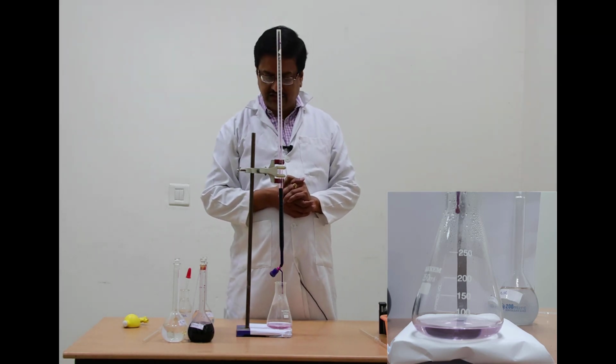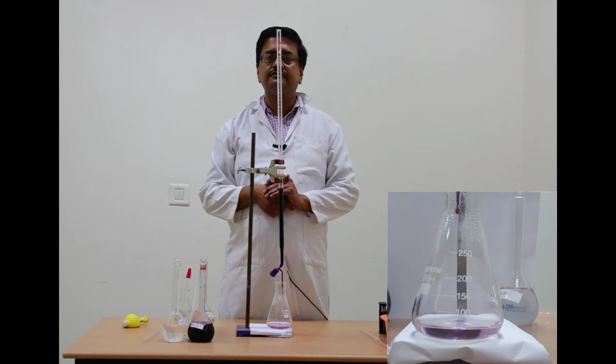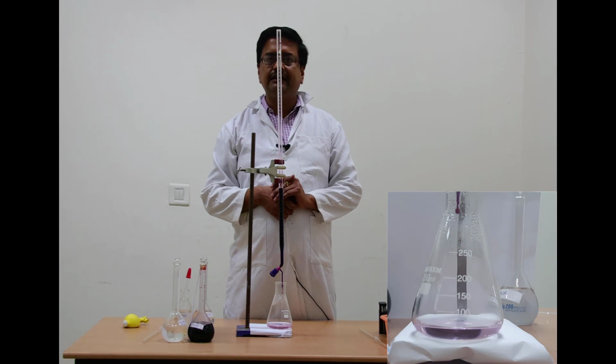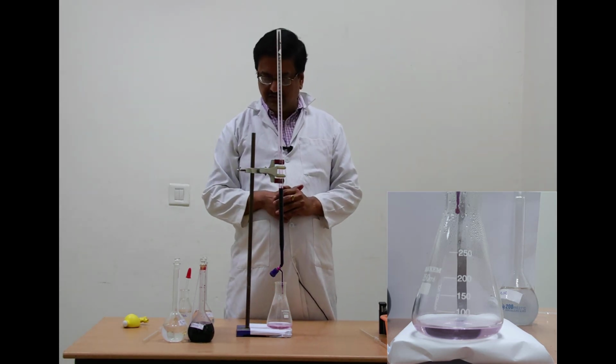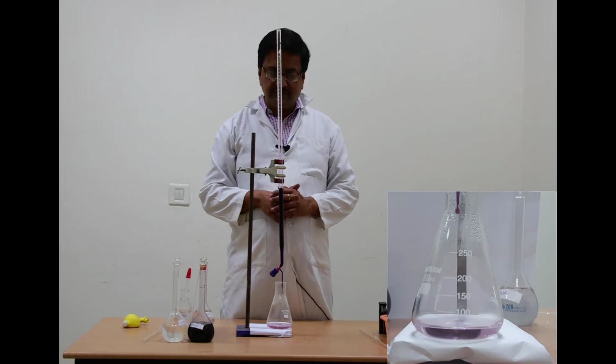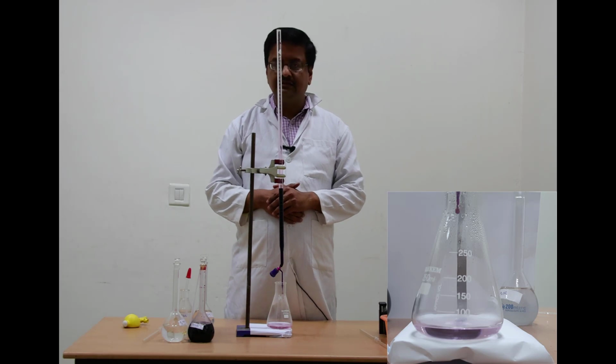So you have one reading as 12, the other one is 12.1, and the third reading is 12.3. So you can take the average of these three as your titer value and do the calculation and determine the strength of this permanganate solution. So this is where we end our today's demonstration.